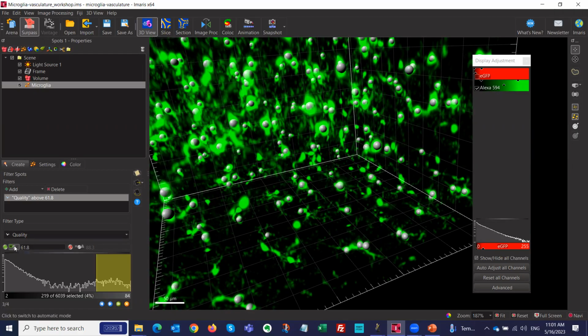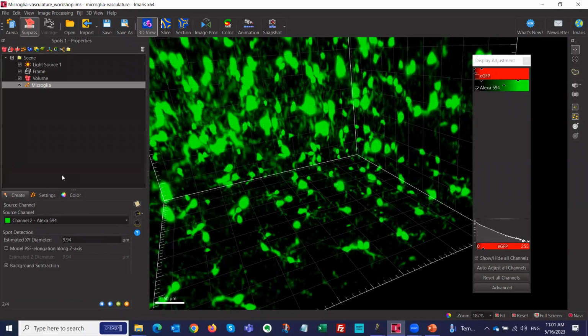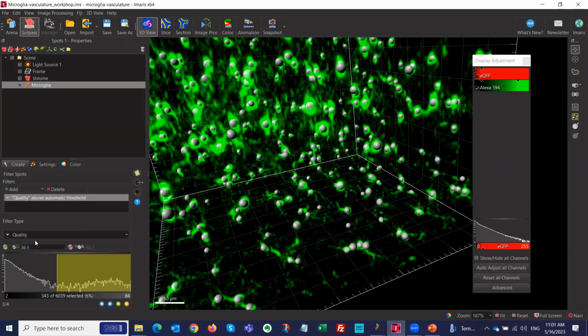Okay. So you probably cannot see this here, but this guy, it's a little M for manual because I changed it. It changed to manual. If I click this M again, it goes back to A, which is the automated. So my recommendation is to trust the automated. What I do is, if it didn't pick up one or if something happens, I typically go back and change things here, adjust my parameters, but rely on the automated to have the least amount of human bias in my analysis pipeline. Okay. So there are ways and times where you have no choice and you have to place a slider. But if I can avoid it, I try to go back and change things.